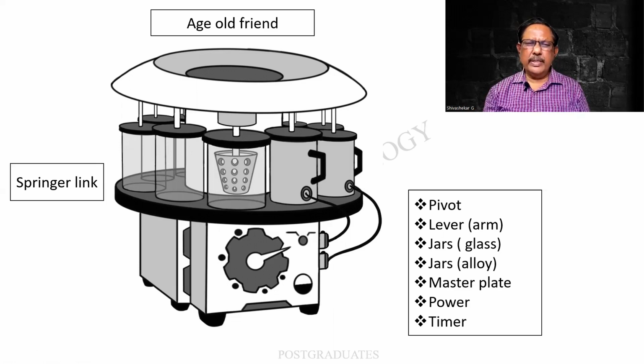The basic steps that you're doing in your routine tissue processing is being done at the histopath. So this at least you people are able to see. It is a beautiful picture. I think it will get registered in our mind. Thanks to Springer Link.